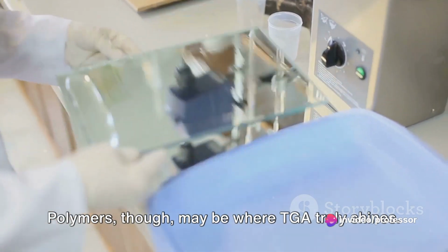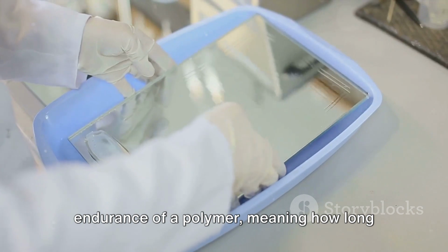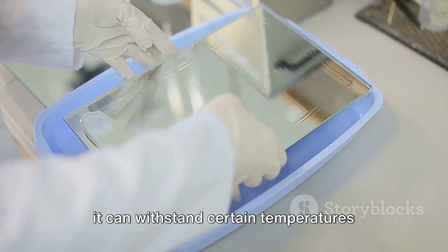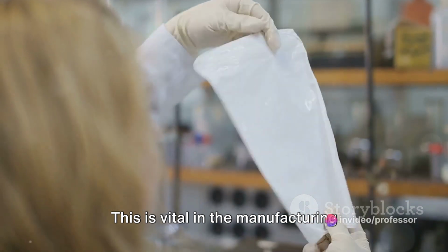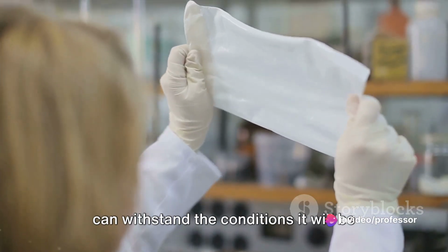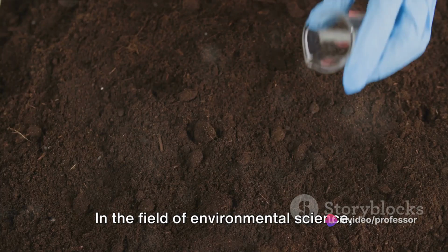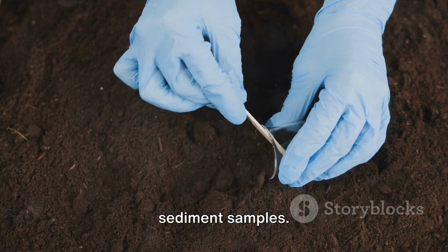Polymers, though, may be where TGA truly shines. It's used to determine the thermal endurance of a polymer, meaning how long it can withstand certain temperatures before it starts to degrade. This is vital in the manufacturing process, ensuring that the final product can withstand the conditions it will be exposed to. In the field of environmental science, TGA assists in the study of soil and sediment samples.